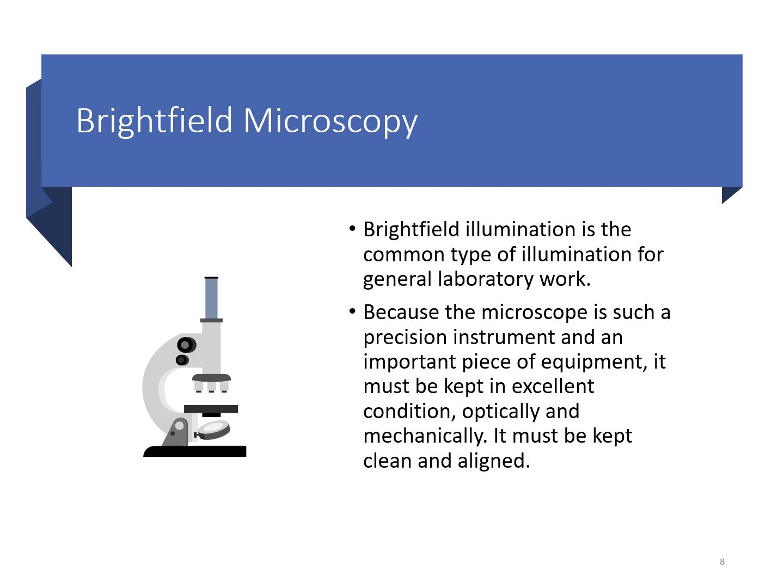And again, most of what we're going to use in the lab setting will be a bright field microscope. If you're doing some more detailed work or some various tests that require other microscopes, then you may occasionally use a different type of microscope, but primarily this is what we're going to use, is a bright field microscope. And so to make sure that you get the most benefit out of your microscope, then there are things that we need to make sure that we know how to do, which is to properly care for them, keep them clean, and to make sure that we set it up properly to meet our needs for our specific eyes.